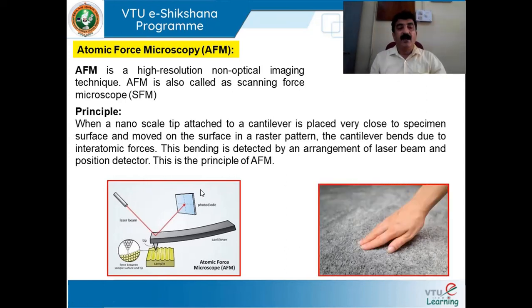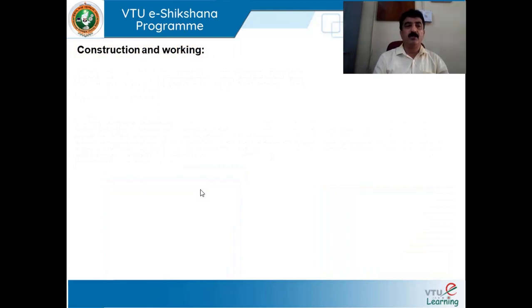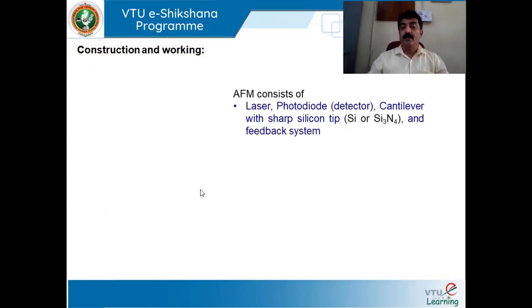It is almost like a touch and feel concept. See, dear students, I want to know whether the surface is smooth or rough. How do you do that? Just by touching. It is sensing, that's all. So it is something like a touch and feel concept. So simple it is. Well, moving on to construction and working.